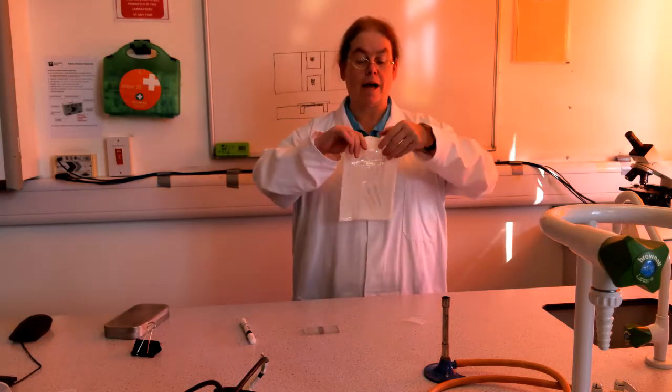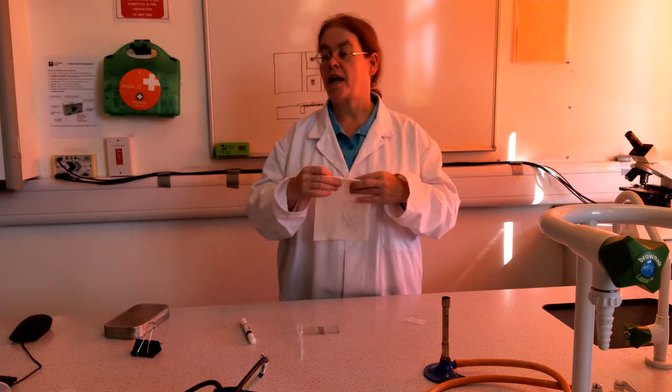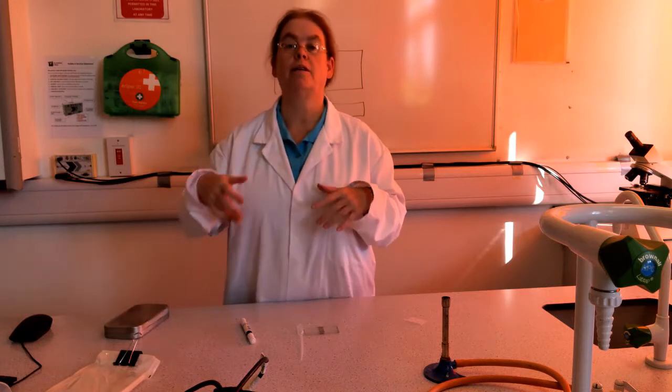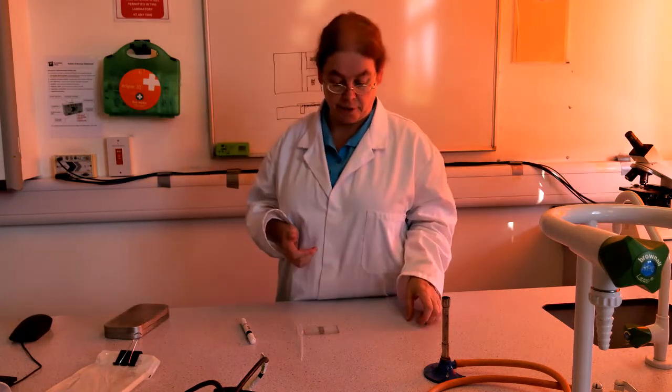There's a special way. It's not going to be sterile, so I'll just put that on the table. There's a special way of loading a haemocytometer, which I'm supposed to teach you. As I say, normally we would test different cultures of yeast.